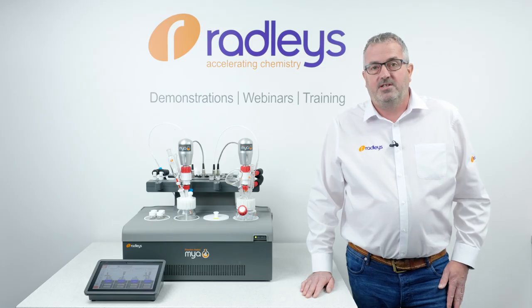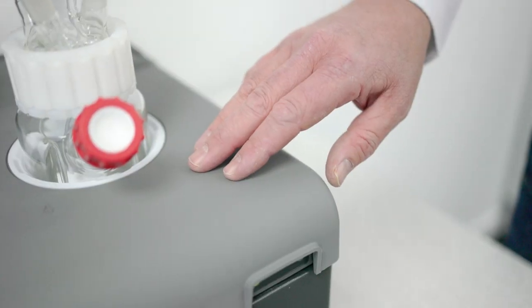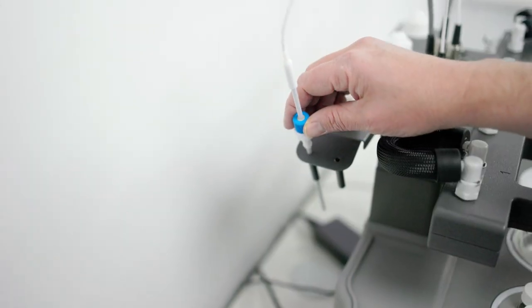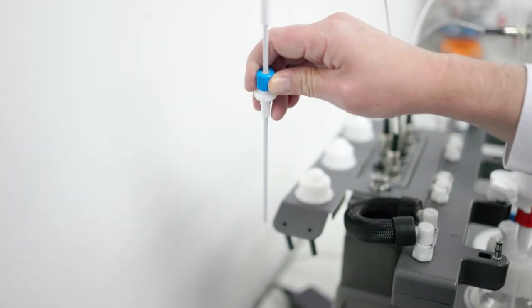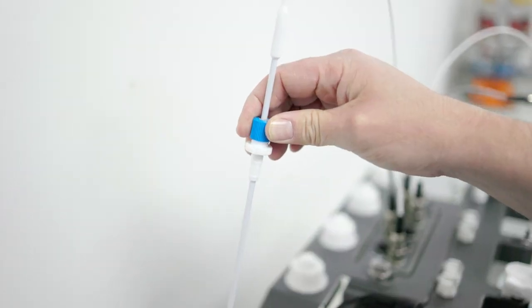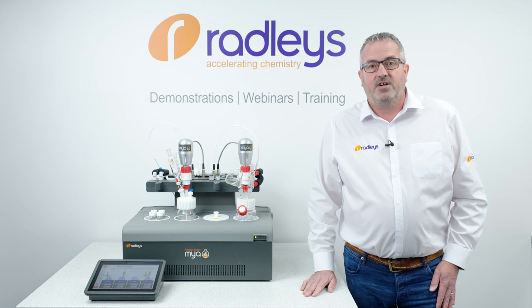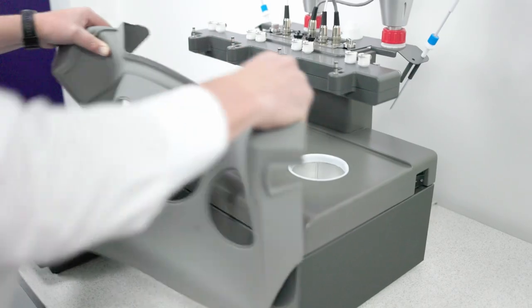The new accessories include a silicon cover, zone lids, an acetal manifold head, the compact stirrer and probe holder, and a newly designed PTFE temperature probe. All these accessories are fully compatible with all Maya 4, old and new.